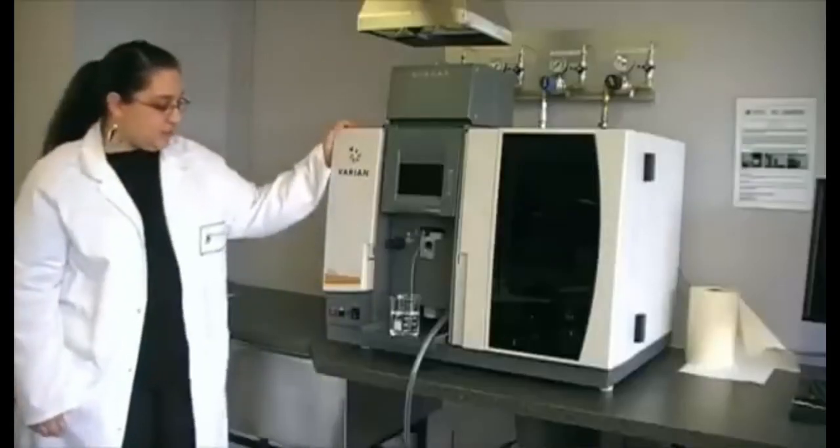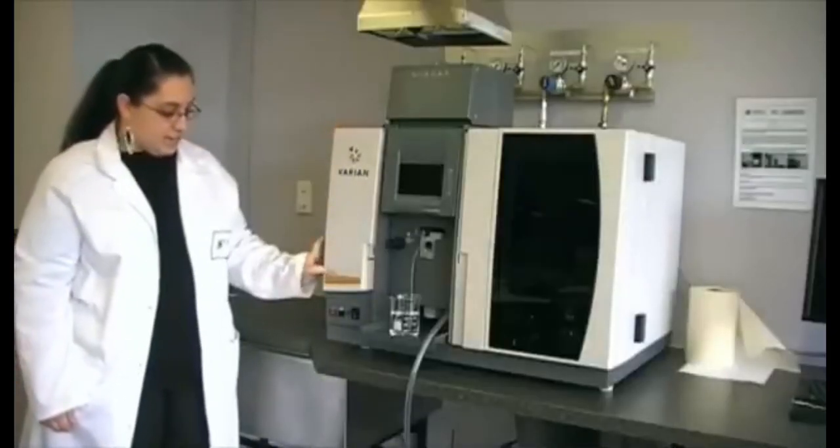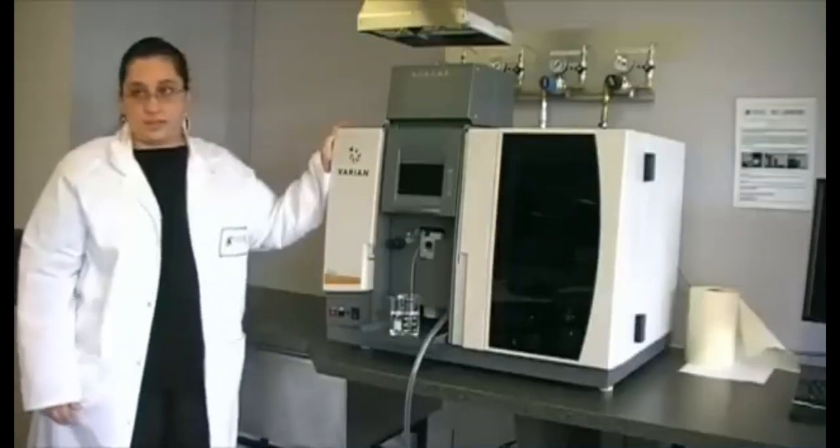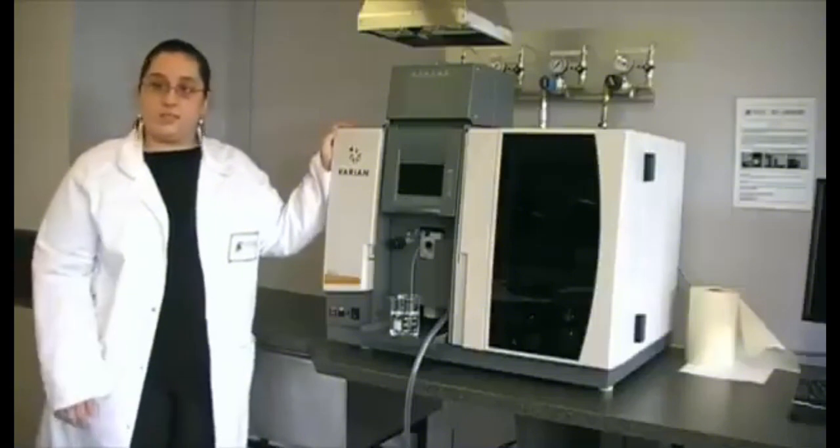My name is Catherine and I'm going to be taking you through the atomic absorption spectrometer. This instrument is provided by Varian and its model is an AA240. So we're going to have a look at how we can actually atomize a sample and then see its absorbance.